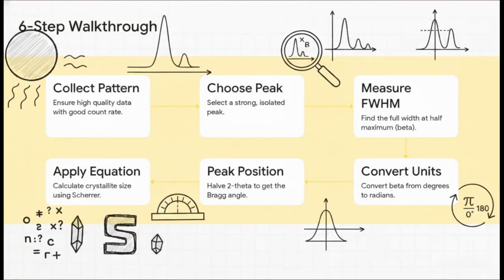All right, Section 3, the 6-step measurement guide, a practical XRD walkthrough. Let's take all this theory and turn it into something you can actually use. Here's how you tackle real lab data in 6 straightforward steps. First up, collect your XRD pattern. You really need high-quality data here. Good count rate, low noise, the whole shebang.